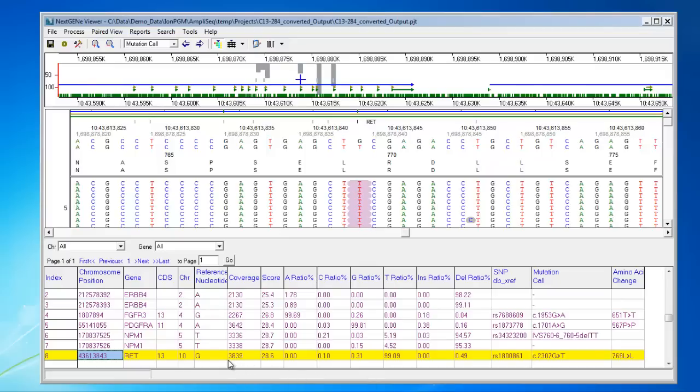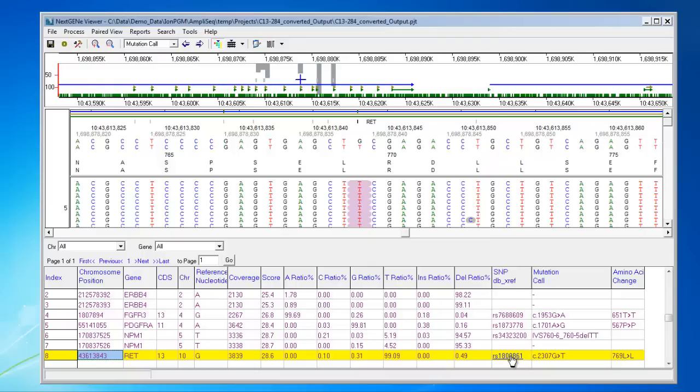In the mutation report, you can see some annotation information for the variant, including the gene name, coding sequence number. For reported variants, you can also see the RS identification number, which is a hyperlink, and if you click on it, it will take you to the NCBI webpage for the variant. Then there's also statistical information, like the coverage depth, as well as a mutation confidence score that's calculated for each variant.